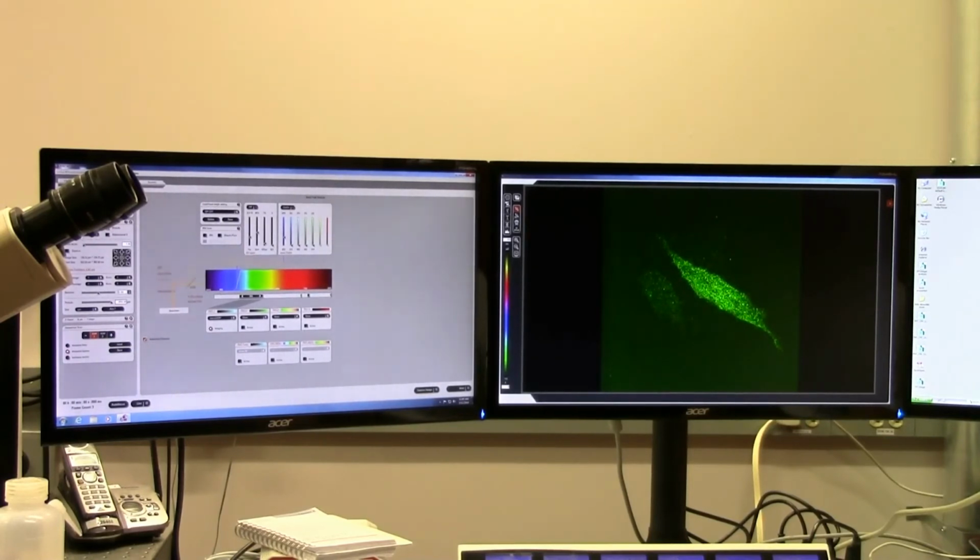Now, you'll remember that we're a 256 by 256 pixel array, which is relatively low resolution. If you want to step up the pixel array just for your fluorescence images, this is acceptable, but you'll have to make sure to turn it back down to 256 by 256 when you're going to acquire your FLIM image. So for this particular case, we'll move it up to 512 by 512.